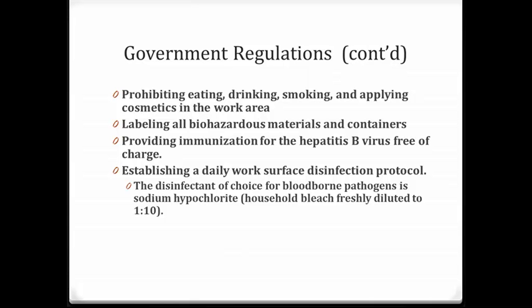The disinfectant of choice for bloodborne pathogens is sodium hypochlorite, or household bleach, freshly diluted — one part bleach to ten parts water. This needs to be fresh daily. Once you get into class, you will pour one part bleach into the spray bottle and fill the rest with water to create your solution. After each and every lab, tables and chairs are sprayed down and wiped with the 1-to-10 bleach solution to kill all microorganisms you might have been working with.